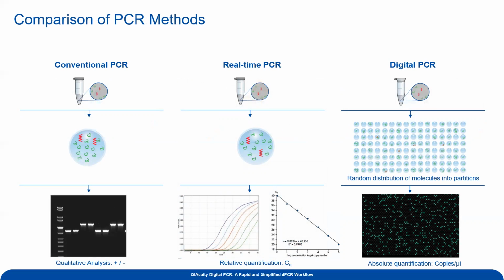And in that tube, you're going to have your buffers, right, that allow for a biochemical reaction to proceed. You're going to have a polymerase, which synthesizes new strands of DNA from your template molecules. And then you're going to have things called primers, right? Those are telling the polymerase where to amplify DNA. And so after that process of thermal cycling, let's say 30, 40 cycles where you heat and cool your reaction, you in theory should get product from that reaction, right?